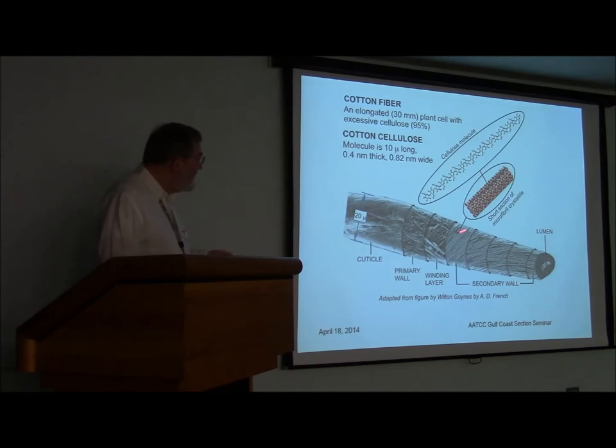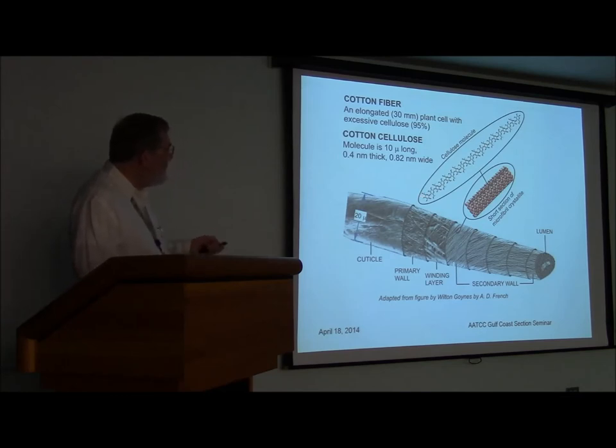And in this microfibril, there are several crystallites of cellulose. Here's a model of a crystal. This one happens to have 49 molecules that look like this, just polymers of glucose here. So mostly what you see, if you make an X-ray diffraction study of a bundle of fibers or of a single fiber, is this secondary wall giving a response to these crystals.